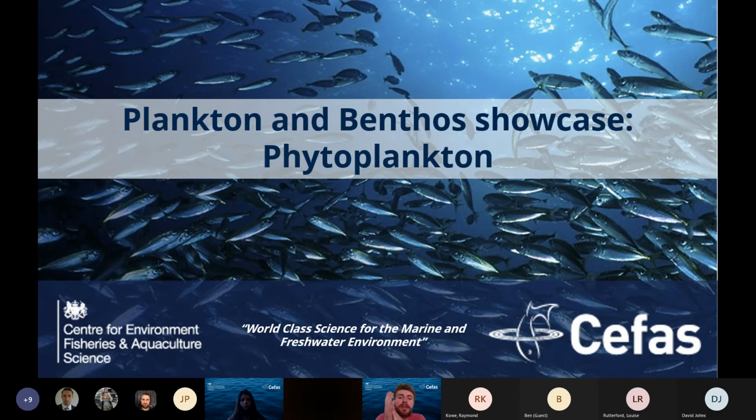So we analyse phytoplankton at Cefas using high-powered inverted microscopes, using something called the Utermöhl method, which I'll touch on in a minute. For anyone who doesn't know, plankton are small, free-floating organisms in the water column, and phytoplankton refers to the plant component of the plankton. Later, we'll talk about zooplankton, which is the animal component, and that pretty much makes up most of it.